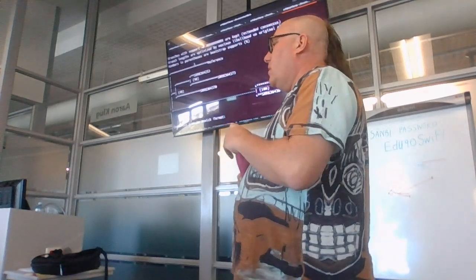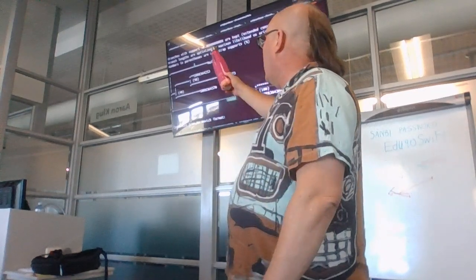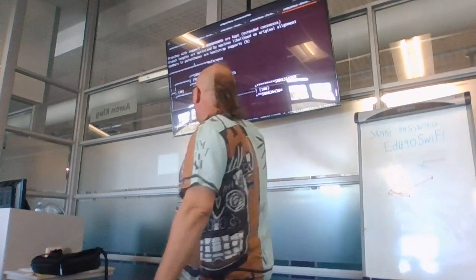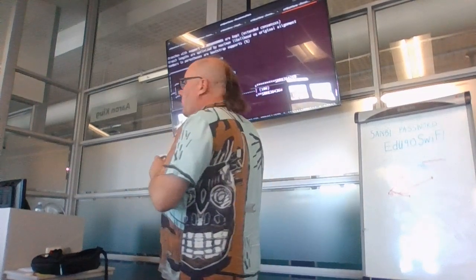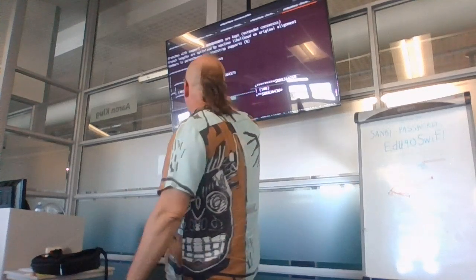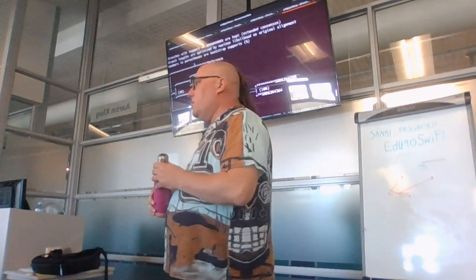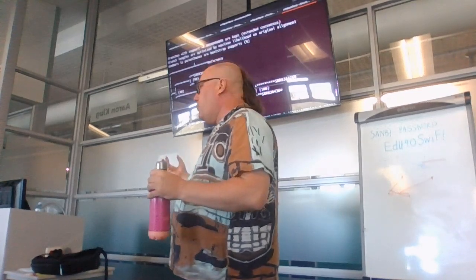And locations? Where is the reference from? So they're all from Haiti. Okay. But the time difference between everything that is an actual sample here, except for the reference, is, I think, 1 or 2 years. But the time back to the reference is 4 or 5 years. So, but of course, the phylogenetic program doesn't know that.